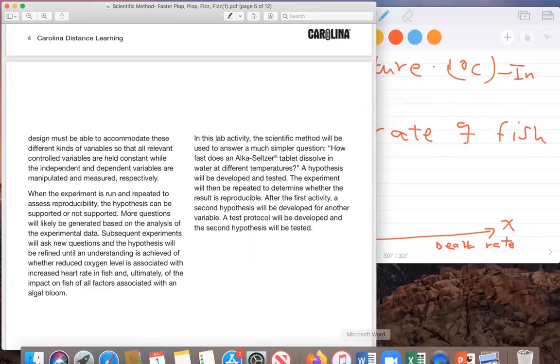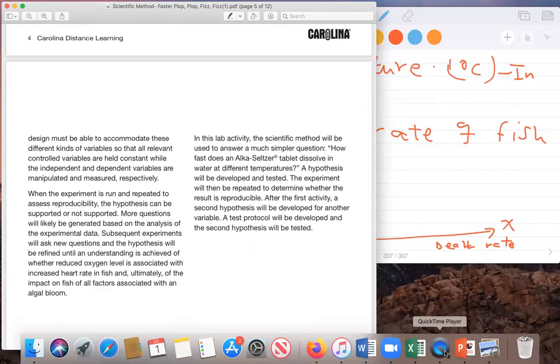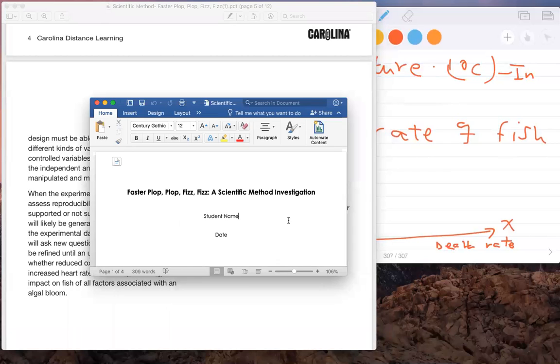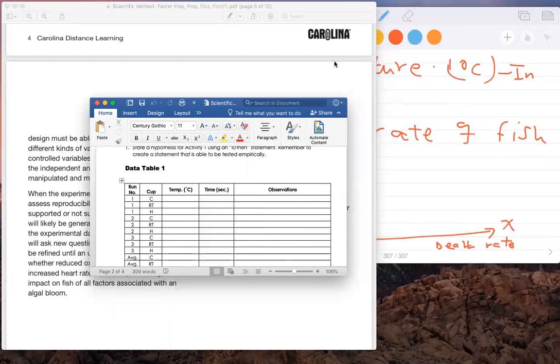Let me pull up the data sheet so that we compare. Oh yes, right here. I wanted to show you the temperatures. This C stands for the cold temperature. Cold is the ice bath.